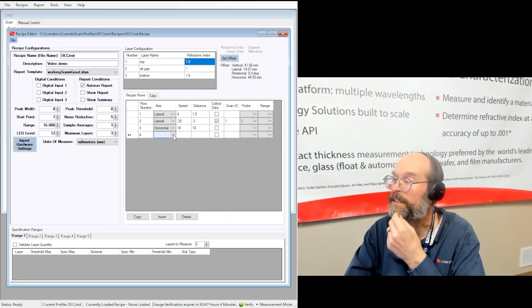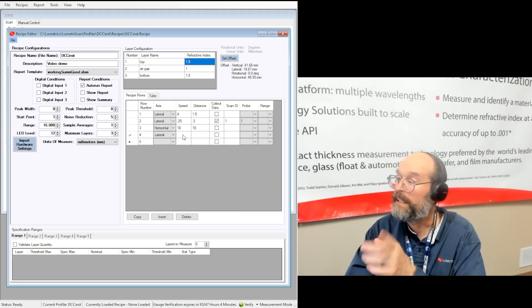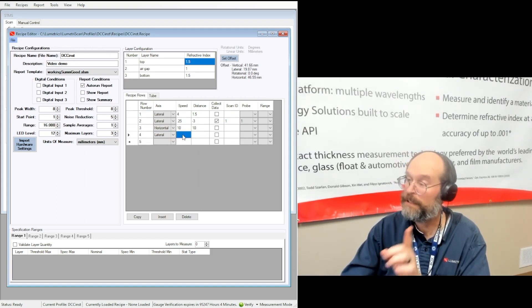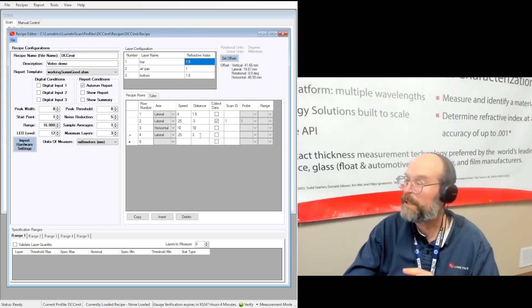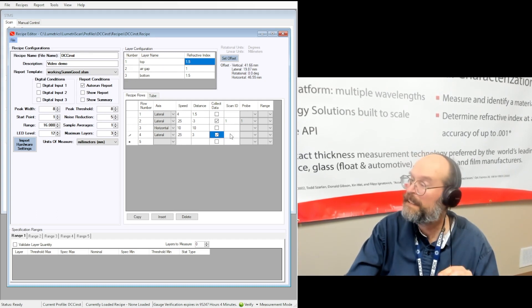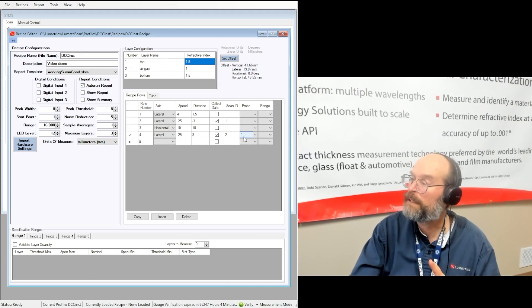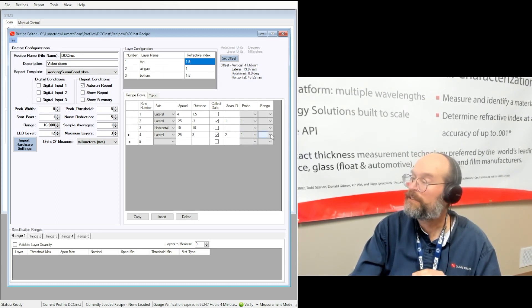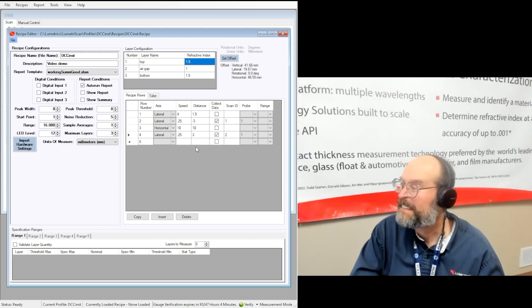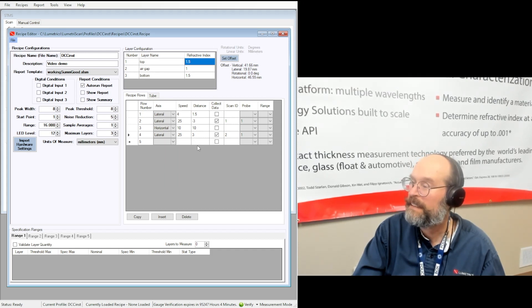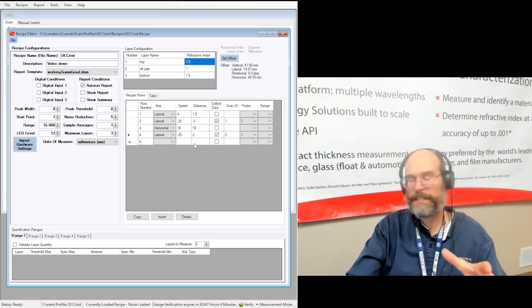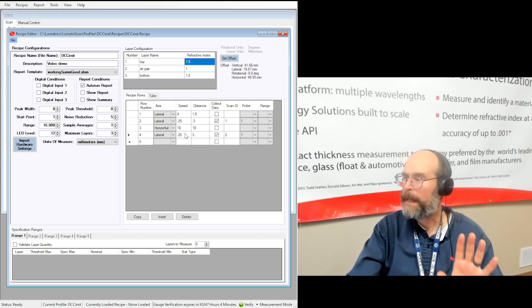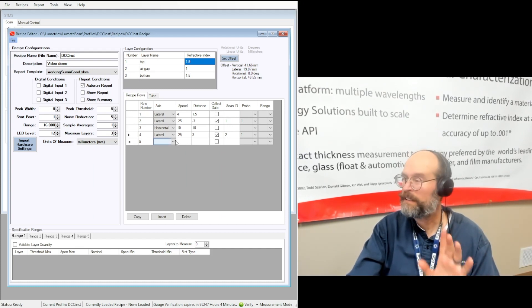And now you're ready to do another scan. So this is another lateral scan, and you don't have to move horizontally anymore. You're already at your new horizontal position, but you can now scan slowly in the positive 3 millimeter direction. You're going to collect data again, and you're going to give it a scan ID of 2, and a probe of 1. We don't have a range yet, but again, I'll get back to that. Okay, so you're collecting data at this scan, you're collecting data at this scan, and now let's say you want to look at, in the same position, you want to look at 90 degrees to this scan you just took. That's, you can do by doing a rotation.